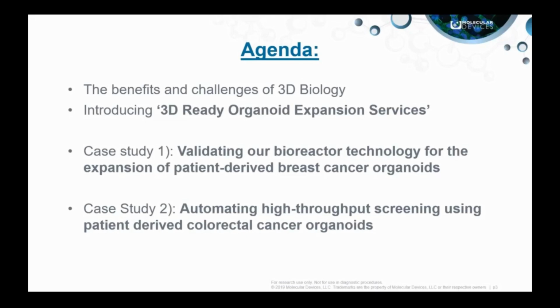One looking at some work to validate our bioreactor technology, which is used in the production process, with a specific example of patient-derived breast cancer organoids. And then she's going to show a nice example using these assay-ready vials in a colorectal cancer example with an automated workflow for a high-throughput screen.